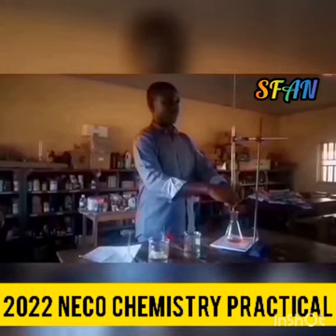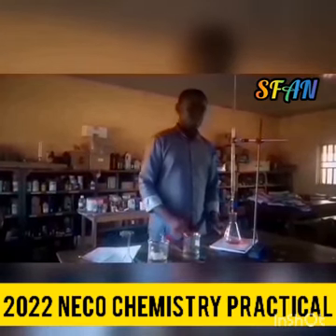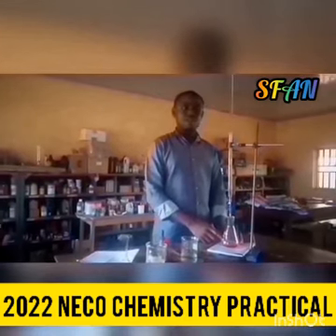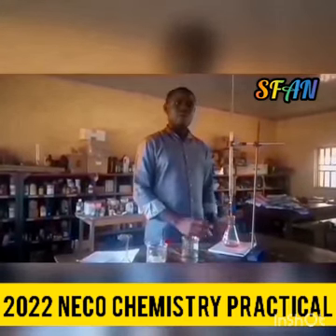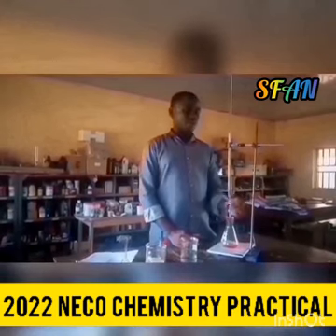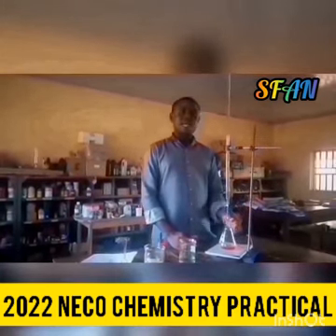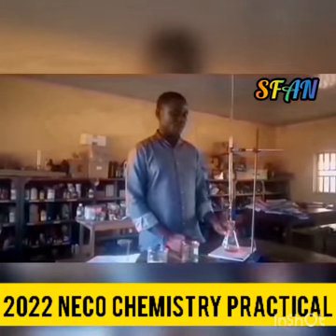And see, the color has changed. You notice that for this first titration, my eye was on the conical flask and not on the burette. When you are performing rough titrations, your eye should be more on your conical flask so that you can easily detect the endpoint. So from that, you can now know when you are getting close to the endpoint for subsequent titrations.